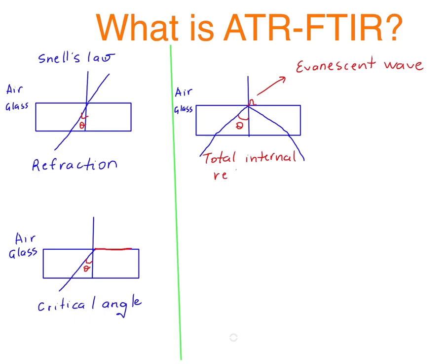Total internal reflection. The major requirement here is that the incident angle should be higher than the critical angle. So higher than, I'm just going to write critical angle, and at that point you can see the total internal reflection.